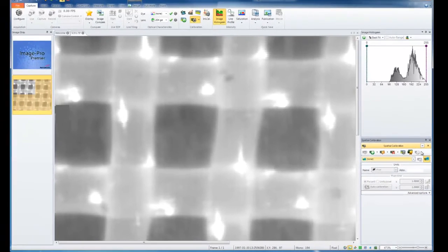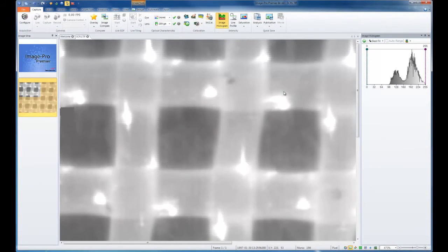If nothing has been created previously for the system, I can create one by either using the wizard, using our auto calibrate function, or I can draw a line as a quick calibration to a reference on the image. Once a calibration is assigned to the image, you'll notice that in the status bar, calibration information is associated. In this example, this image has only pixel values.